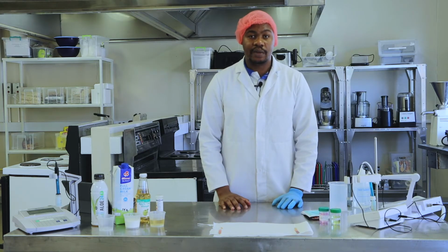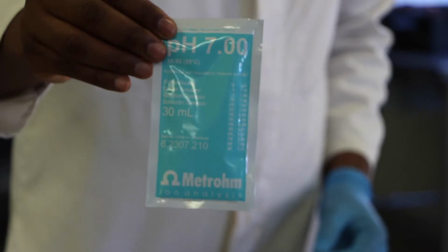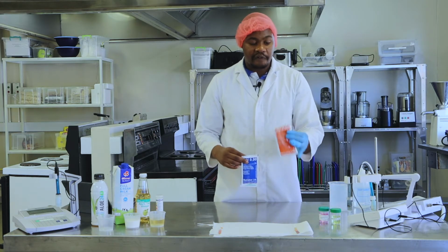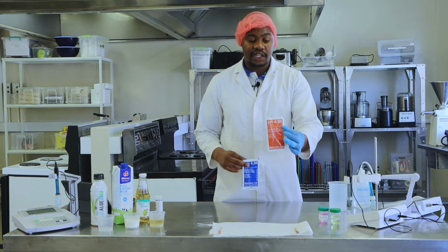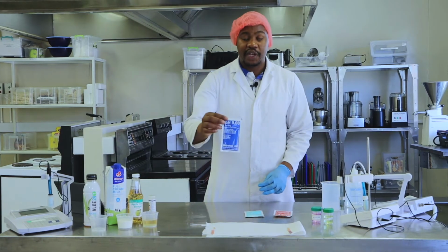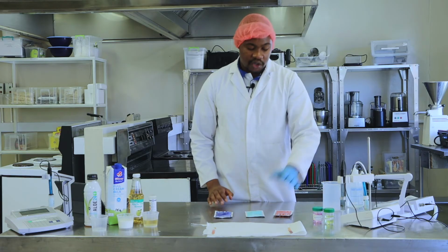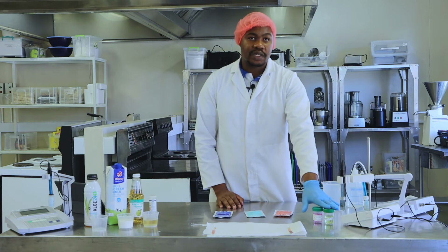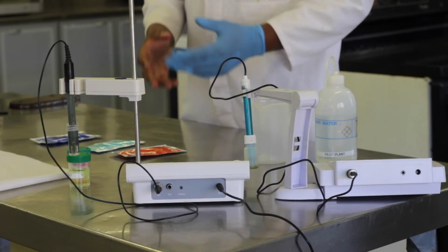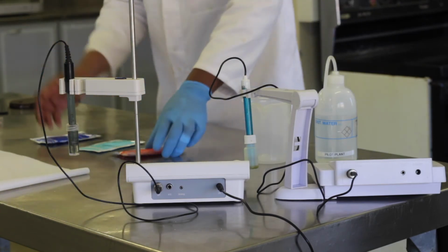So what do we use to calibrate a pH meter? We use what we call pH buffers. There are three types of buffers. You can have pH buffer 4, which checks the acidic nature, pH buffer 7, which is the neutral, and pH buffer 9, which is the alkaline. Here I've got two buffers. We normally decant these buffers into these small containers or holders. This pH meter has already been calibrated. I've checked it, and it's still functional. So I can then take my buffers and put them on the side here.